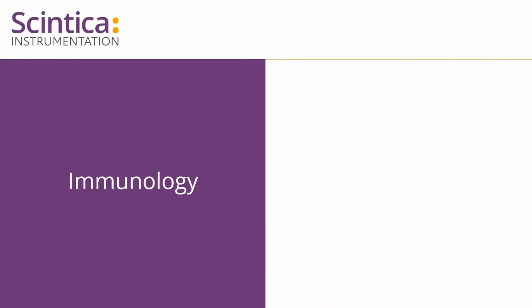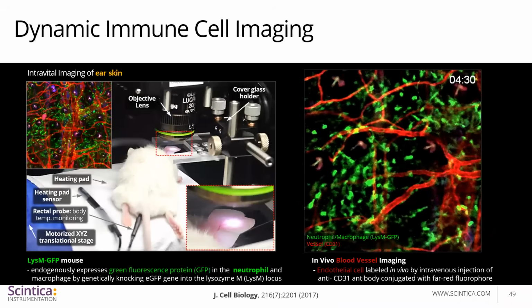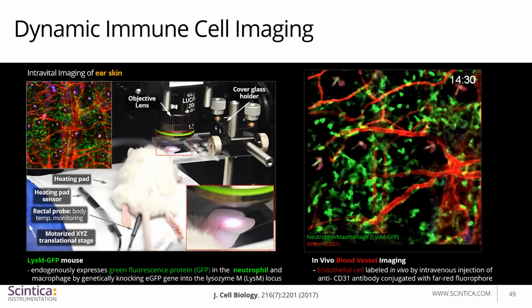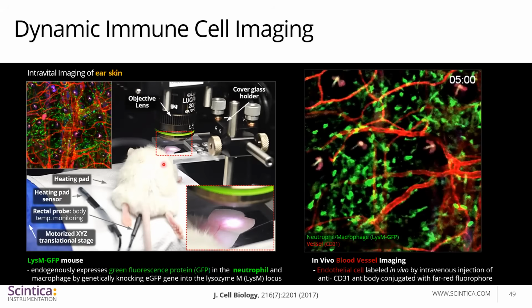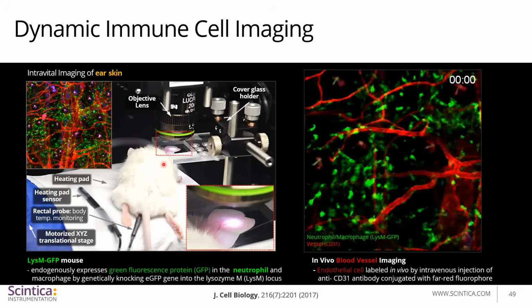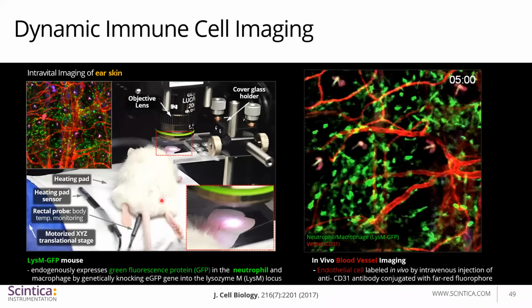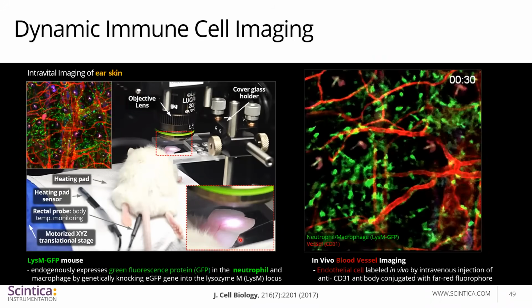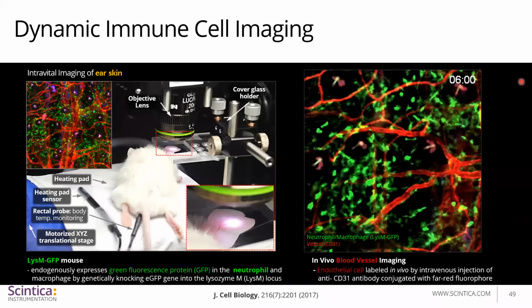There's also an abundance of immunology research studies using intravital microscopy. In order to study an immunological response, researchers here used the ear window chamber model. In fact, there's no window needed here, nor surgical manipulation, so it's one of the easier models to employ. The skin is just thin enough to be able to image right through with confocal microscopy.